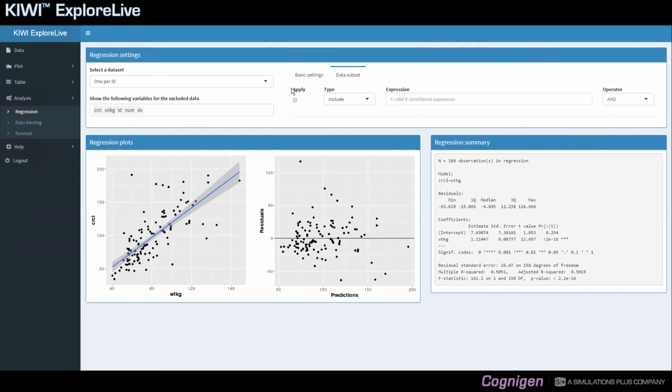This concludes the presentation of the linear regression functionality of the ExploreLive module.